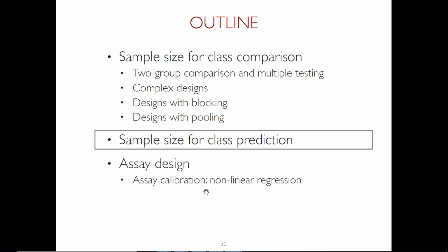And so the very last thing I want to tell you about is how we do sample size calculation by simulation. This is something which we also implemented in our software, and we find that some of these calculations that we discussed make different assumptions. And as we had a question earlier, what if we need more technical replicates for various reasons and so on? It is easier to build these types of issues into simulations than into the mathematical calculations. So what we can do is simulate different outcomes of experiments in the future and see which types of experiments are more effective than others.